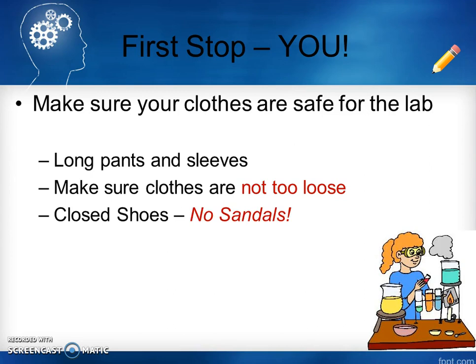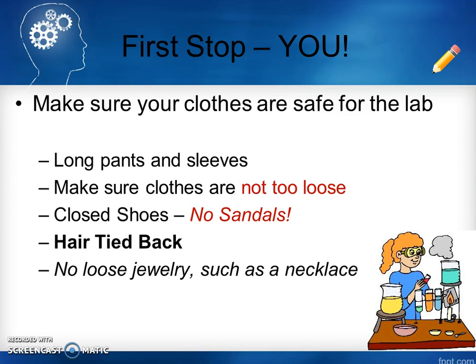No sandals. Just like the long pants and sleeves, you want to make sure that your feet are covered as well. Hair tied back. Just like the loose clothes, make sure your hair is out of the way, doesn't knock anything over, get into anything. No loose jewelry, such as a necklace. No contacts, glasses only. And this has to do with the fact of maybe heat or some chemical that could bond the contact to your eyes.